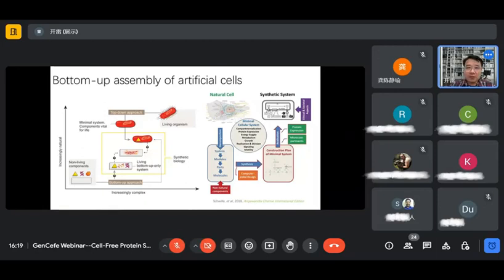As I said, you can really fine-tune or define your environment that can still preserve the basic transcription and translation function, which would give you opportunities to really synchronize all the different activities that exist or continuously happen in a real cell. Okay, I'm not going to spend too much time on this topic either.